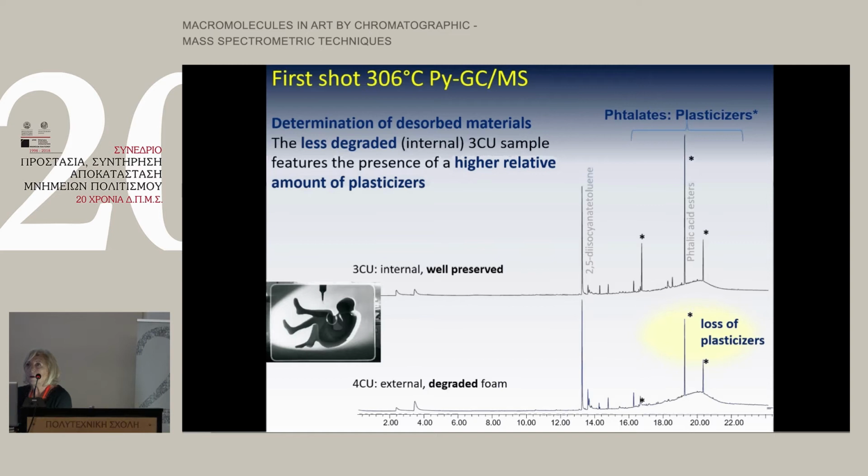When we analyzed only the additives and the plasticizer, we had a surprise because in the degraded foam, the amount of plasticizer is very, very low.